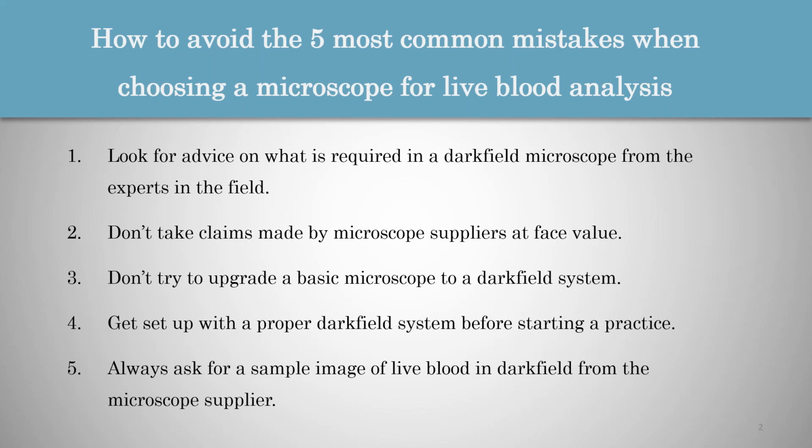So will you miss some of the pleomorphic forms, for example? Yes, absolutely. So with a phase contrast system, even things like fibrin, which is fairly common in live blood samples, is not as clearly visible in phase contrast as with a good quality dark field system. So although you'll still be able to see it, you won't really see it to the extent that it really is in the case. So it might appear as a low grade finding where it's actually much more advanced.